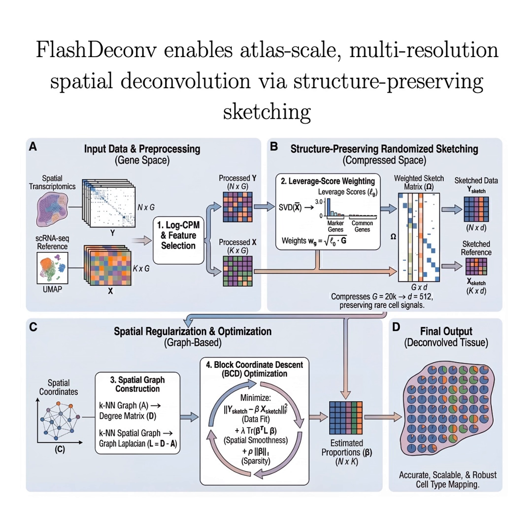But that scale brings a huge burden. How so? Well, if you have an atlas with millions of data points, and the analysis you need to run takes days for just a tiny piece of that, you've hit a wall. A massive computational bottleneck. And the key analysis here is something called cell type deconvolution. That's the one.